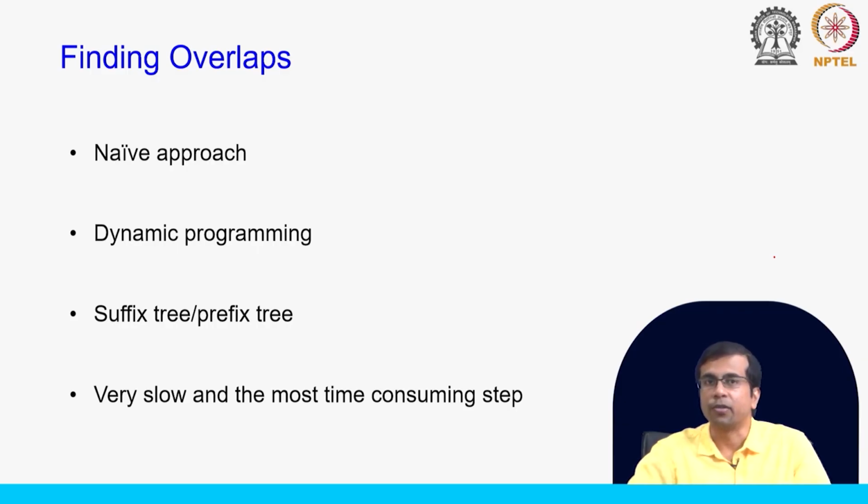The second part is that the overlap graphs are quite big. Each node is a read, so the graph that you construct from this overlap analysis will contain billions of nodes, identical to the number of reads that you work with. So, this is a time consuming step, and this is also a quite big structure because of the number of reads that you are working with.